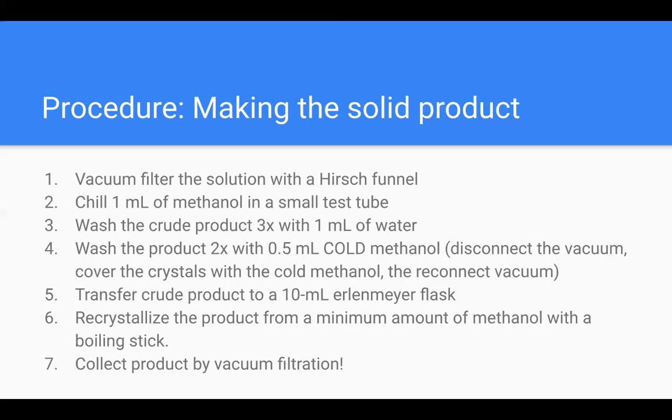We're going to then transfer the crude product to a 10 milliliter Erlenmeyer flask, and we're going to recrystallize the product from a minimum amount of methanol. And then we're going to collect the product by vacuum filtration.